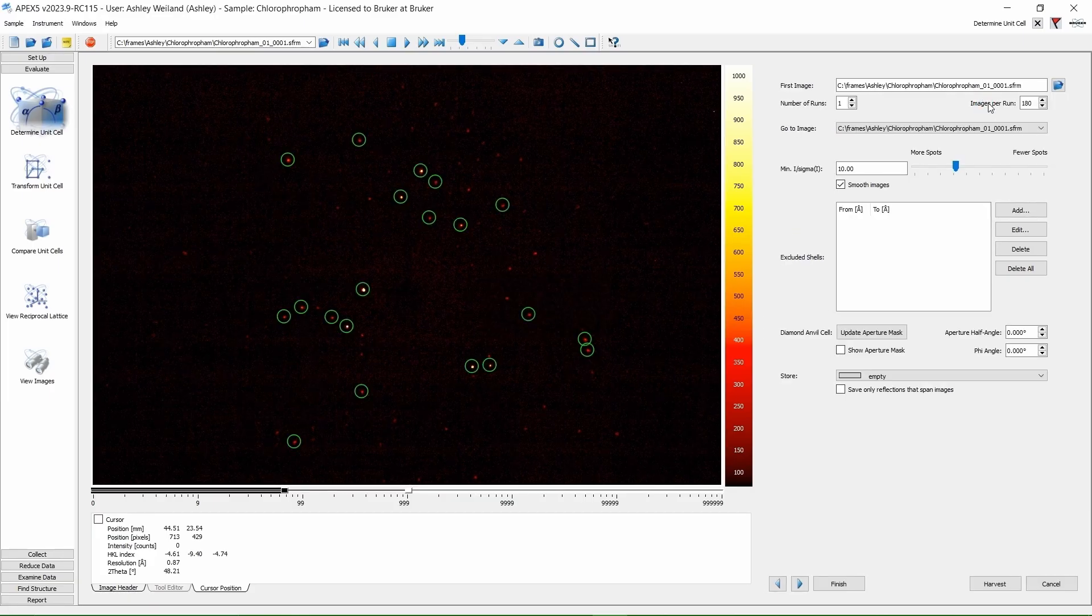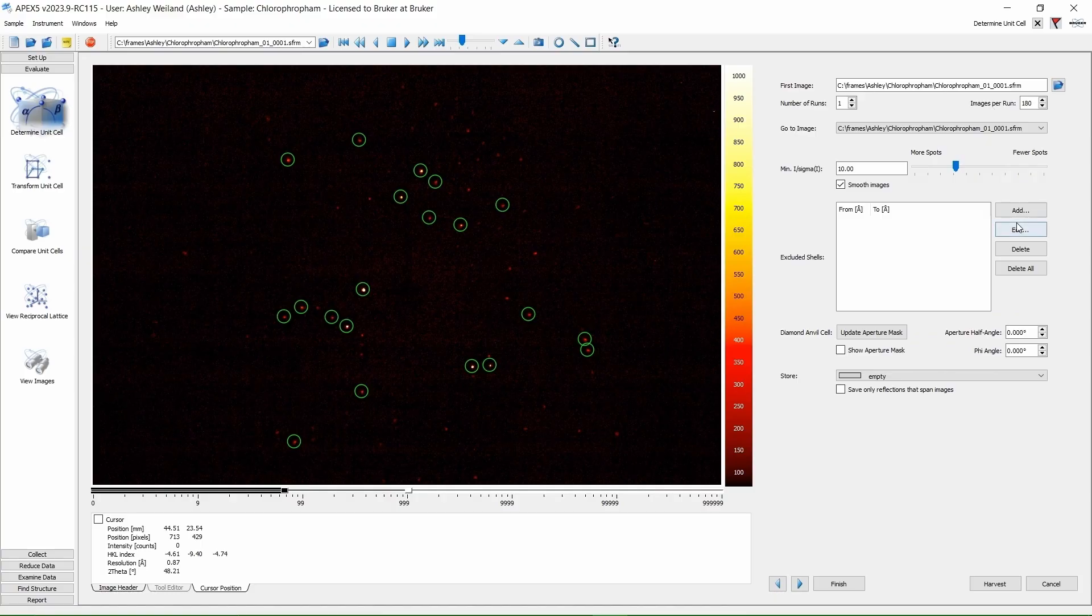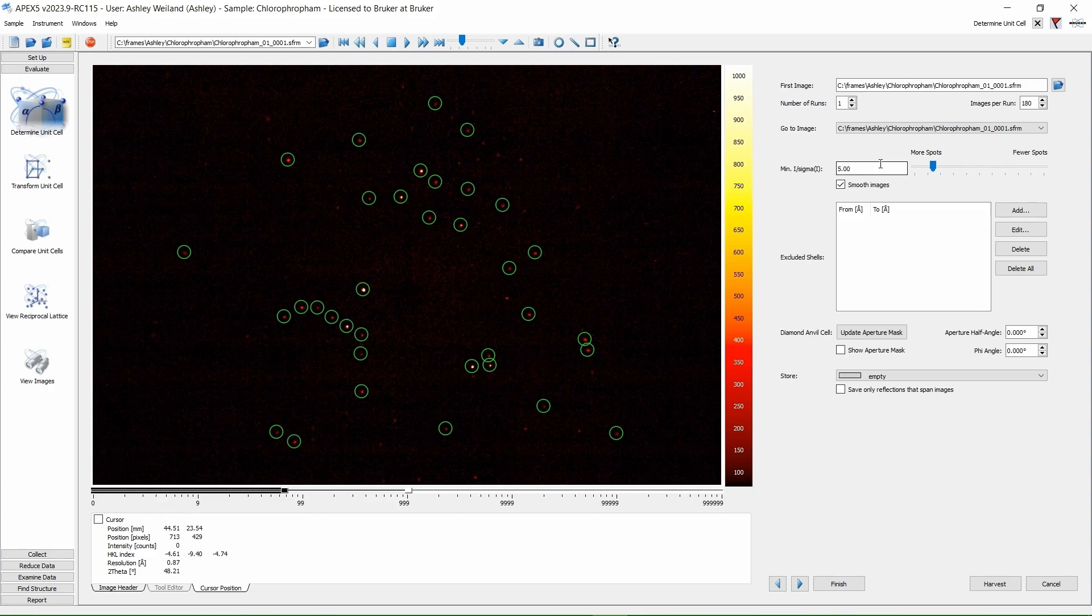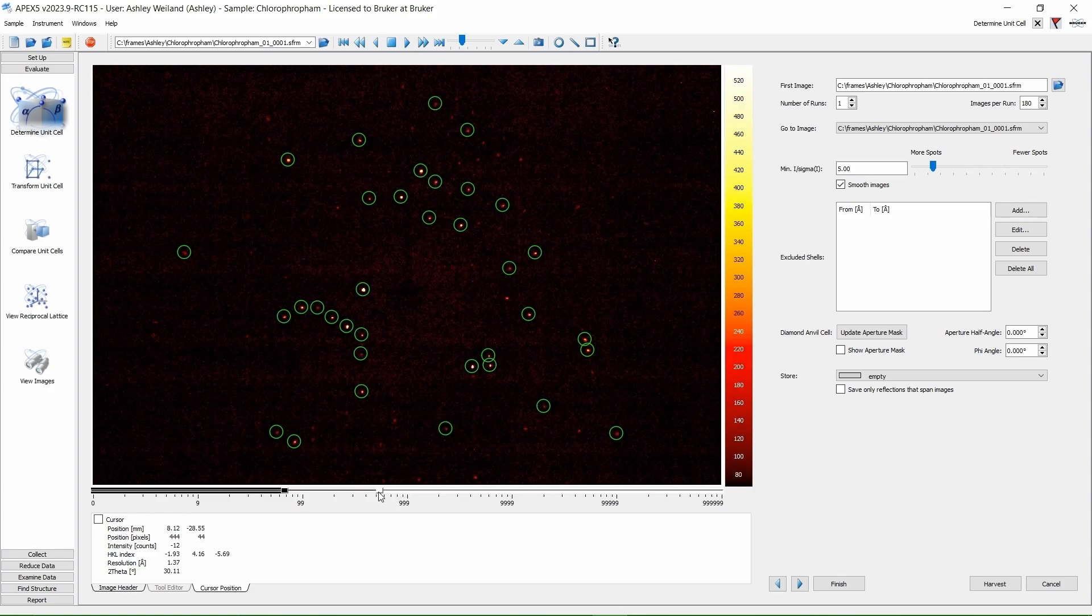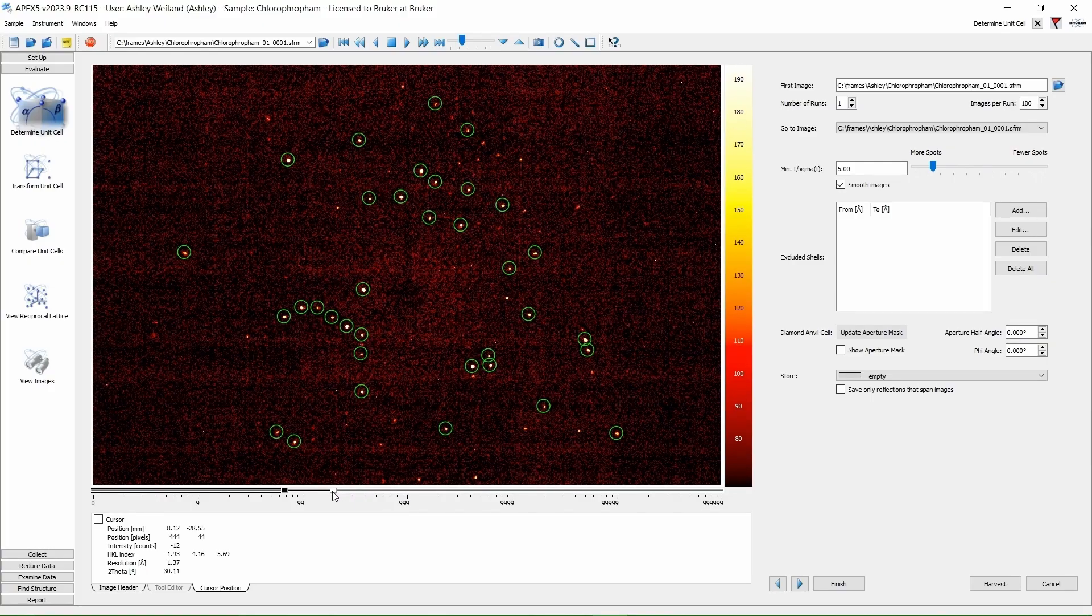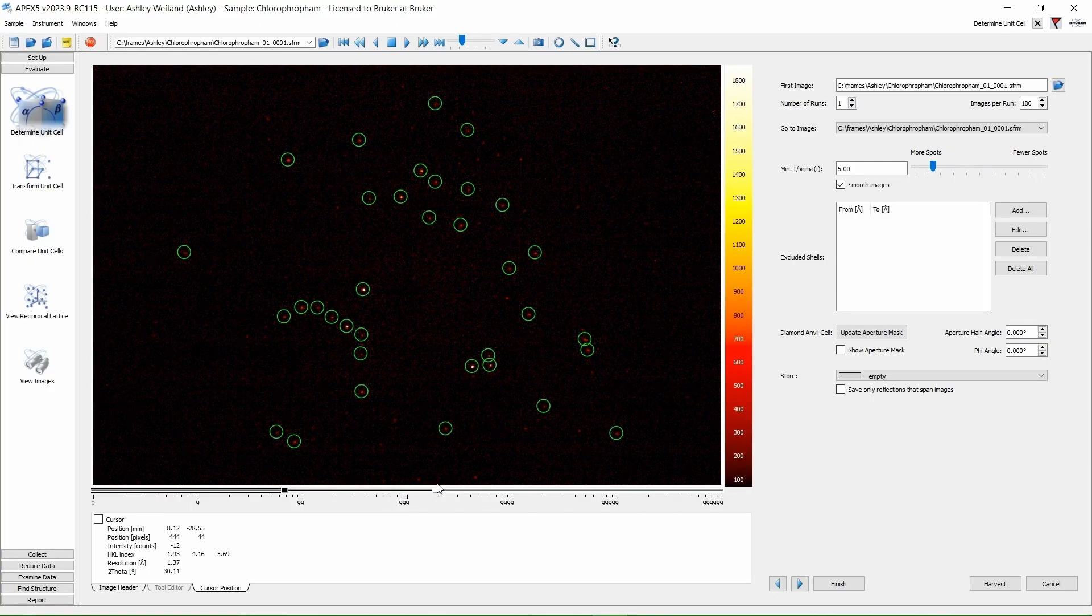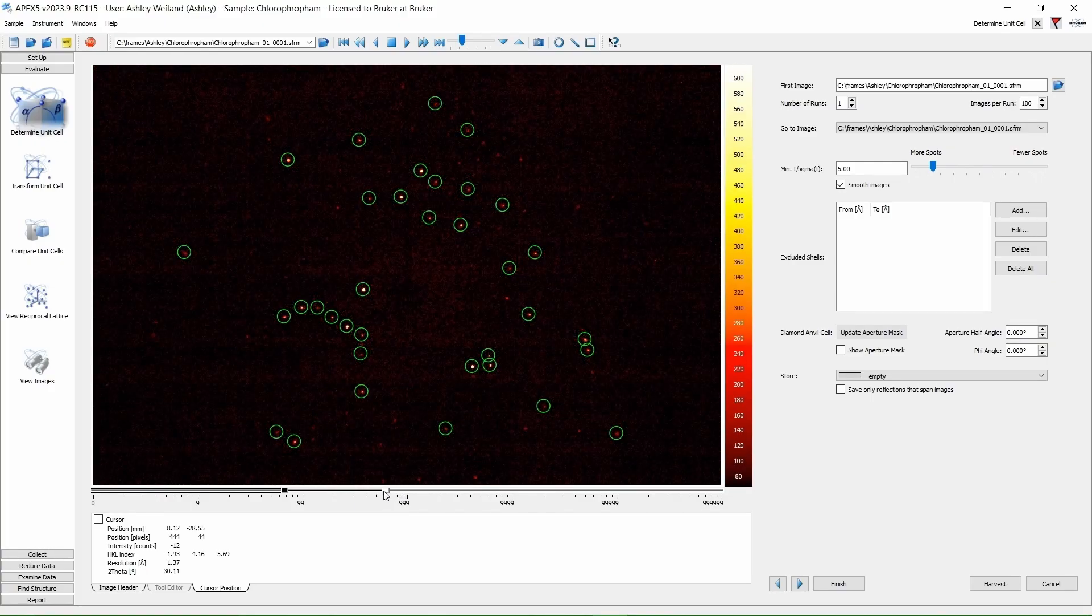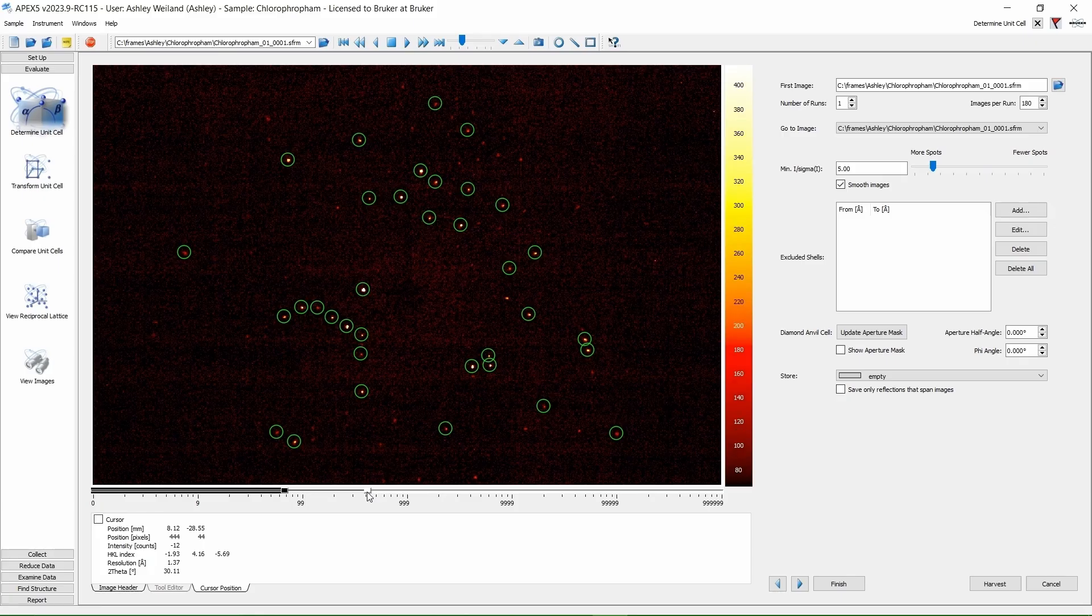Here you can change the amount of reflections you want to harvest by changing the signal-to-noise ratio. I am happy with 10 for this sample, but if you have weakly diffracting data, you can decrease this signal-to-noise ratio value. You can also adjust the slider bar to change the contrast of your image.